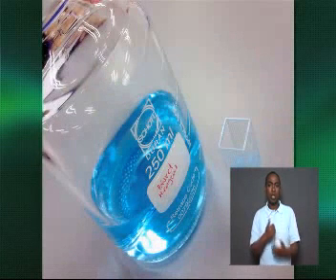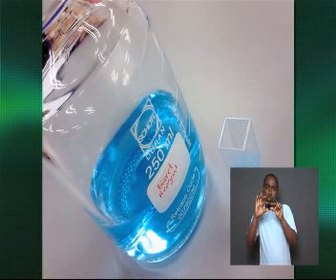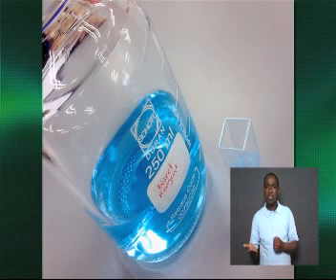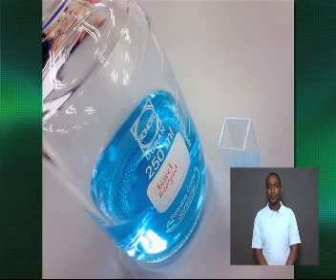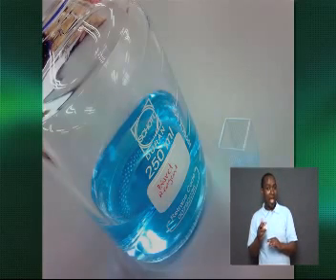To conduct this test, the necessary materials include test tubes, a sample substance, and a Biuret reagent. As we learned in our last lesson, a reagent is a solution or compound that is added to a substance in order to bring about a reaction.